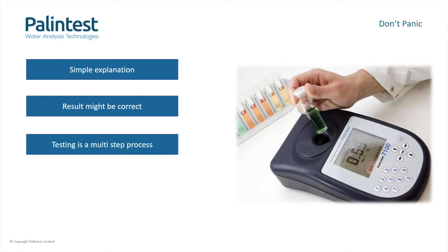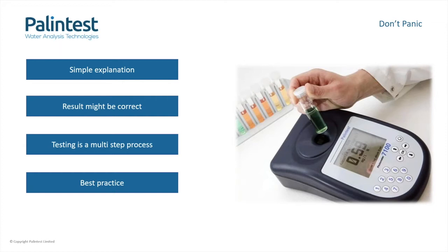The most important thing to appreciate when carrying out a water test is that it doesn't start when you put the sample in the photometer and press read. That is really the final action in a multi-step process. So best practice involves care and attention right from the beginning.